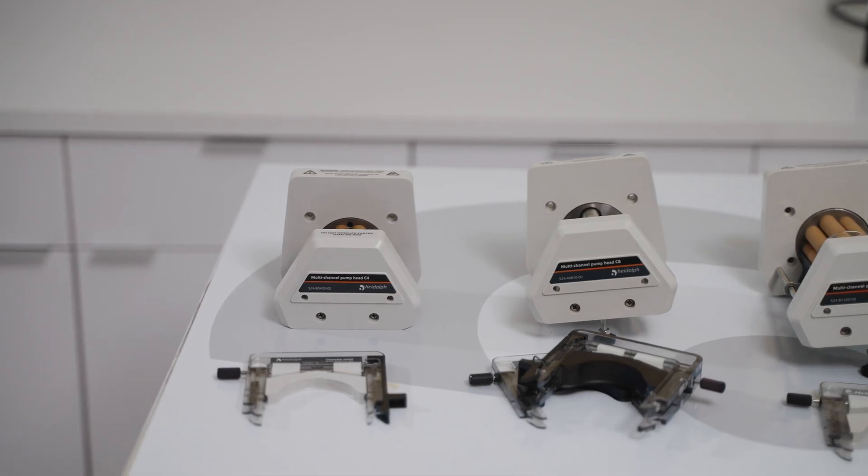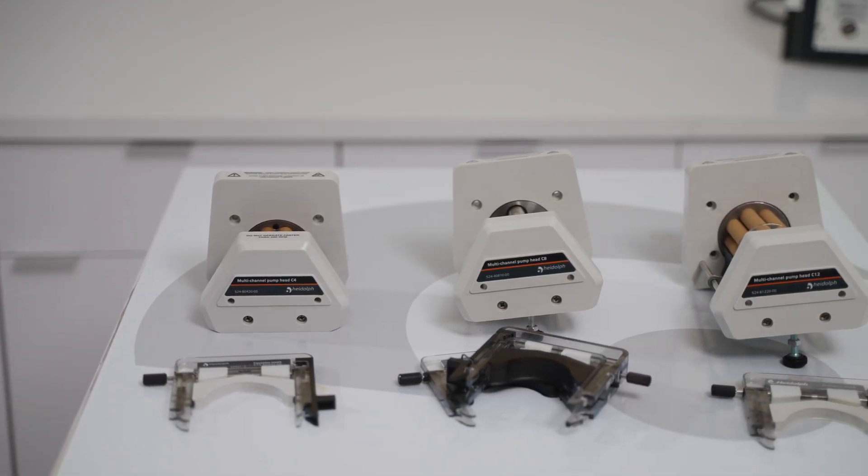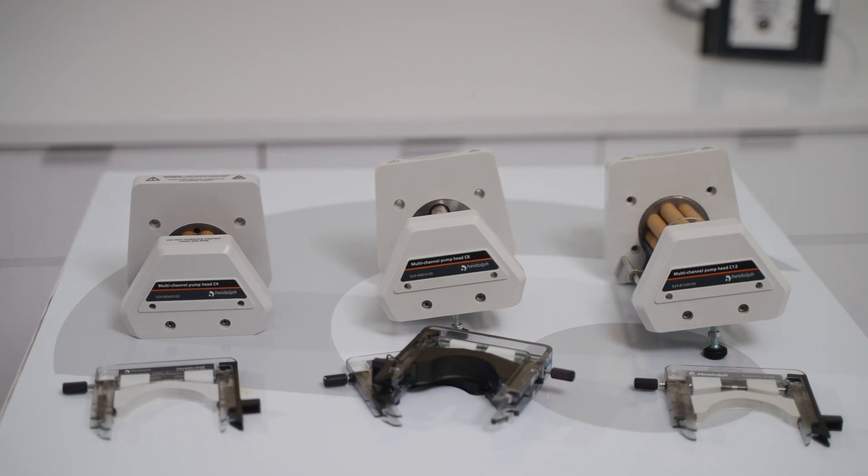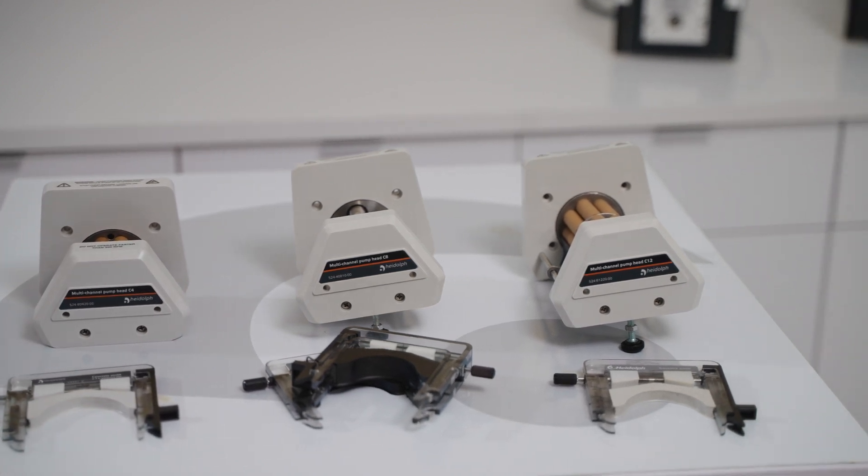Heidolph currently offers three different multi-channel pump heads. These pump heads are adaptable to our Heidolph Core 120, Heidolph Expert 120, and the Heidolph Ultimate 120.